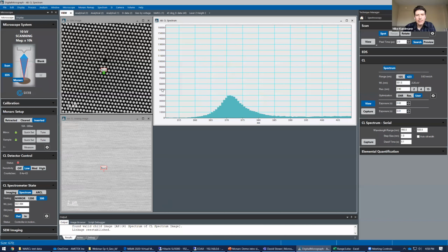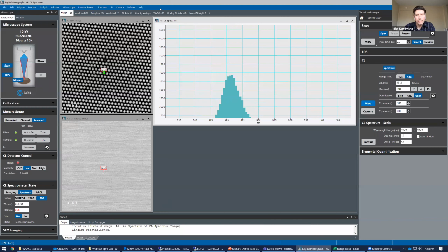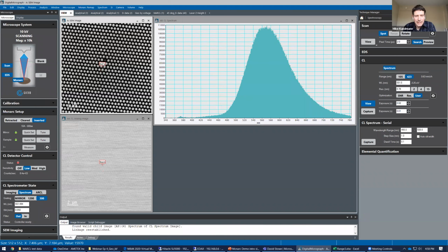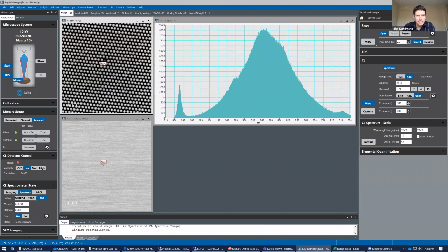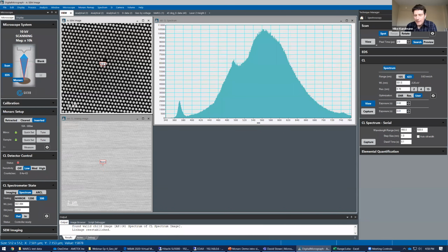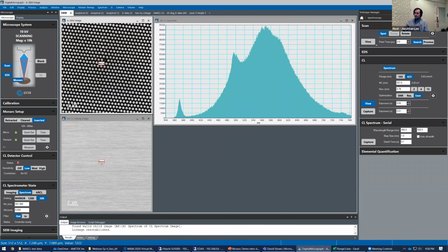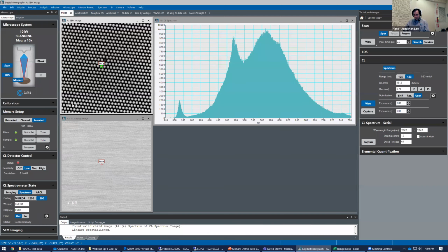Can you say what the inherent wavelength resolution of the spectrometer part is? Like, if you had something that was emitting at exactly however many nanometers, how wide would the peak look, just because of the finite resolution of the spectrometer? Right, the point spread function. It's not very much. It's mostly dependent on all of the reflectors inside the system and the dispersion.